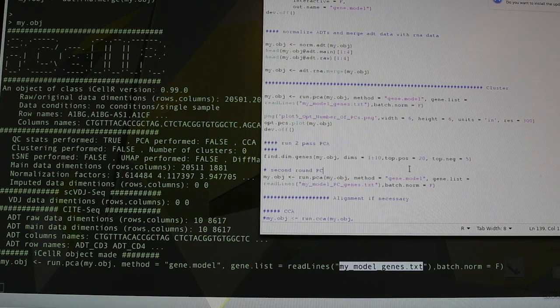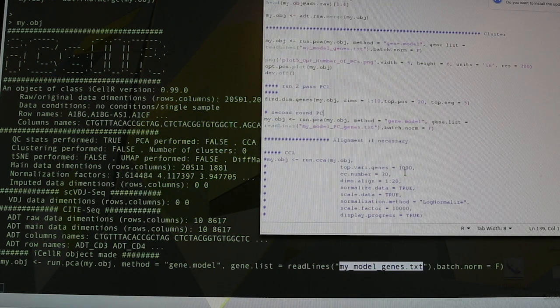So you can just choose them earlier here and run PCA one more time if you want more segregation, like having each cluster a little bit further from each other, more defined, but not necessarily. So if you wanted to, you can run this two-step PCA.